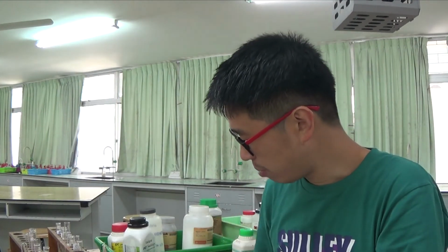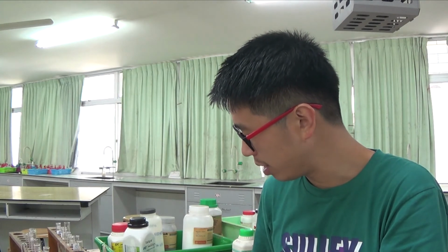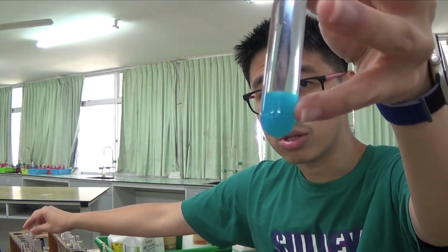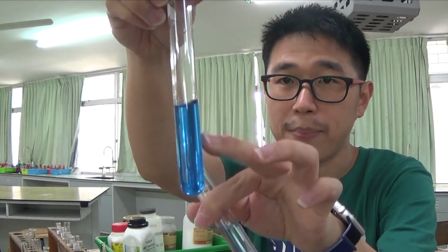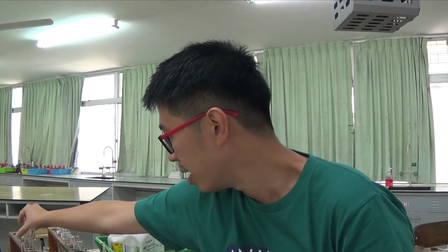So there's the precipitate remaining insoluble in excess NaOH for the pale blue color precipitate, which was the copper 2 hydroxide. This is actually not copper 2 hydroxide anymore. Something has happened, and I'll talk about it in another tutorial video, specifically on the case study of copper 2 chemistry as part of the A-level A2 transition metal topic. Okay.